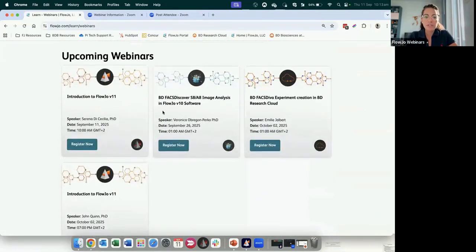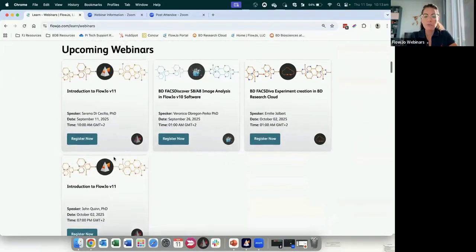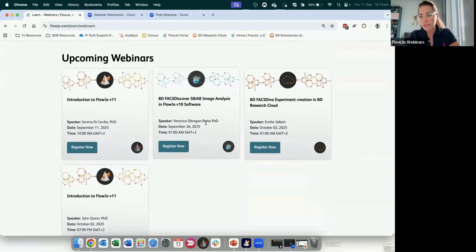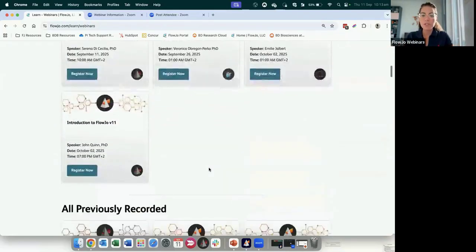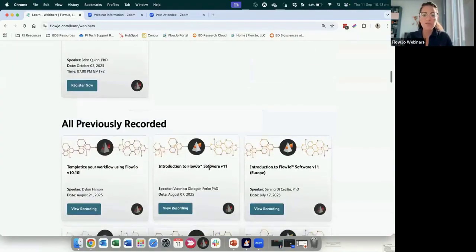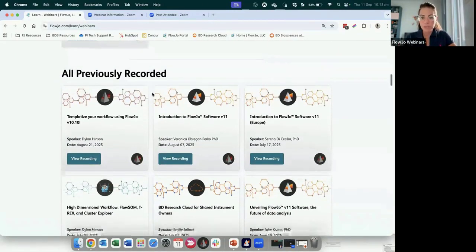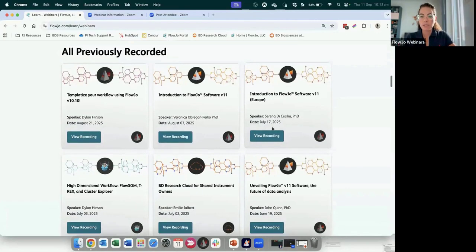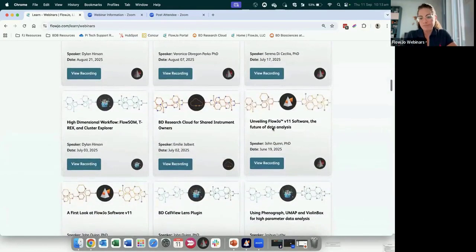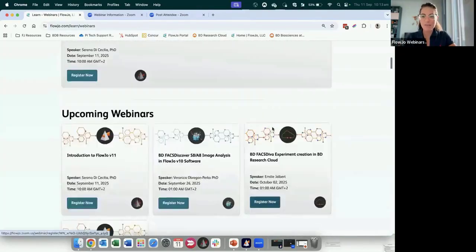There is another introduction to V11 in October from John Quinn, but we also do have webinars regarding imaging analysis and BD Research Cloud. You can register to these ones. And this webinar, you will find it right here under all previously recorded webinars. There was one as well in July that I did, which is already available here. And you can navigate and find all the many webinars that we have.